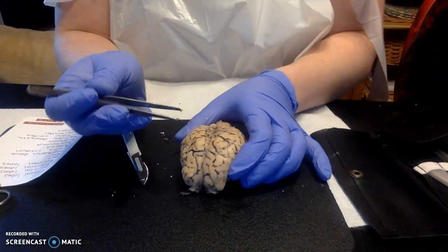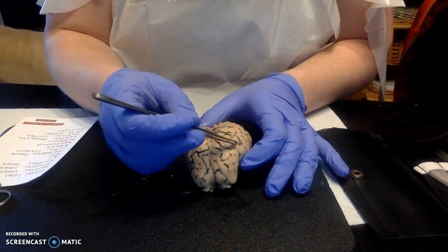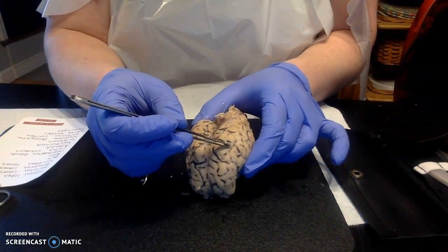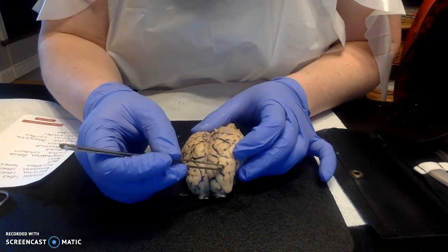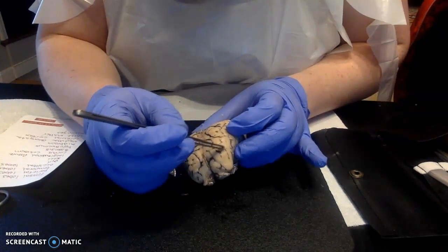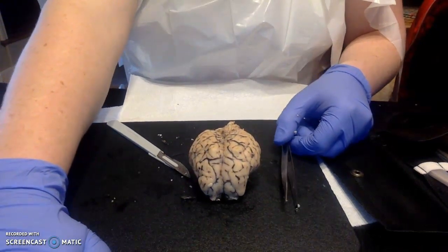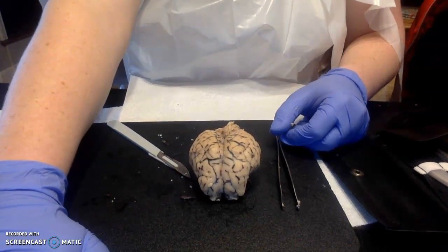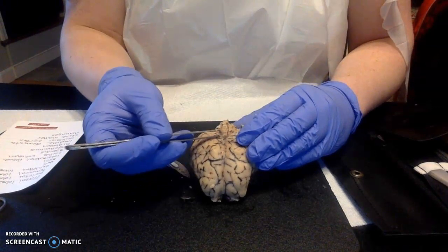We have the gyri right here. Down a little bit further is the sulci or sulcus groove. As you move down. Oh, in the longitudinal fissure, I said.